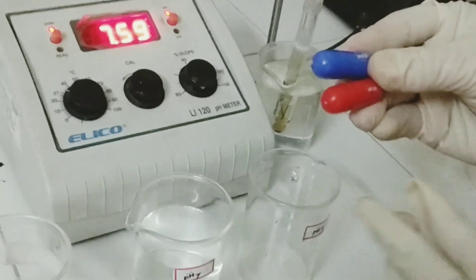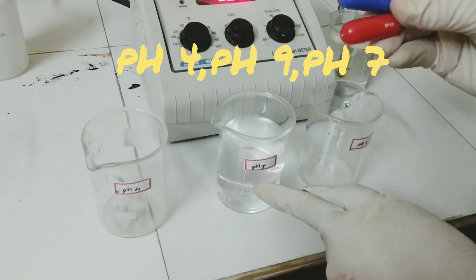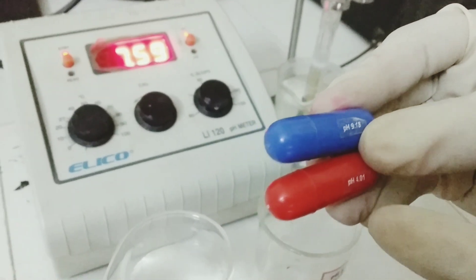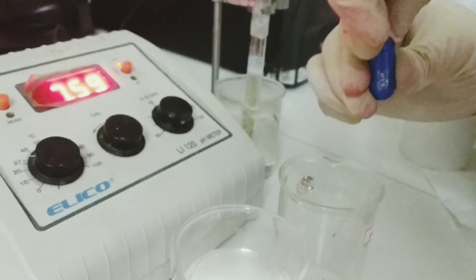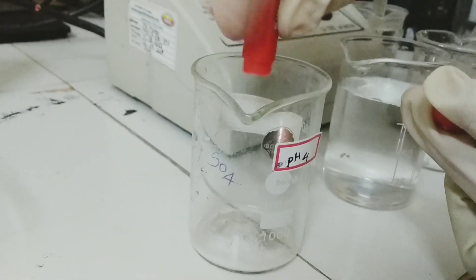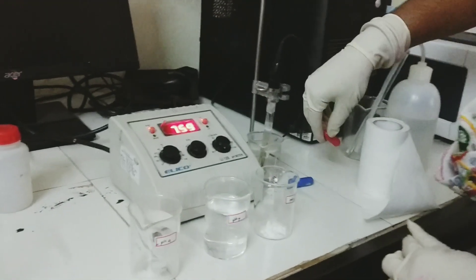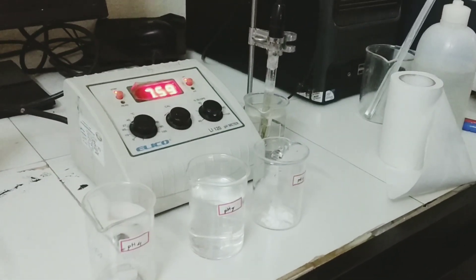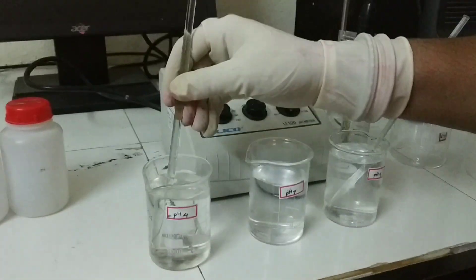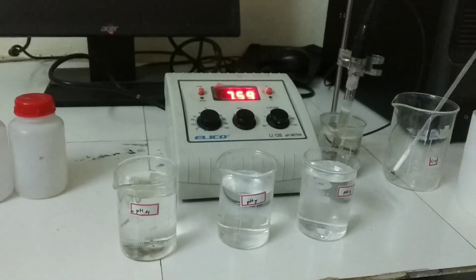Calibration of the pH meter is done using buffer solutions — pH 9 buffer, pH 4 buffer, and pH 7, which is nothing but distilled water. These are buffer tablets: a pH 9 buffer tablet and a pH 4 buffer tablet. With these tablets I am going to prepare the buffer solutions. This is the commercial pH 4 buffer and this is the commercial pH 9 buffer, which are dissolved in 100 ml of distilled water to get the respective solutions. The buffer solutions are now ready and we are going to calibrate the instrument using them.